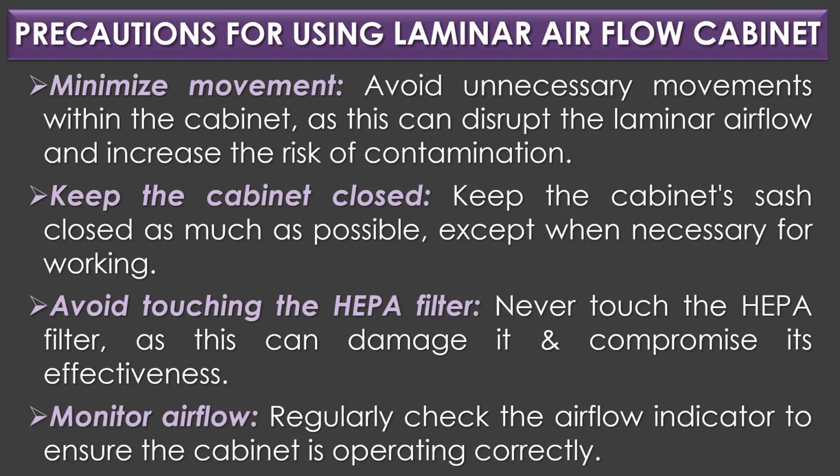Minimize movement. Avoid unnecessary movement within the cabinet, as this can disturb the laminar airflow and increase the risk of contamination. Keep the cabinet closed. Keep the cabinet sash closed as much as possible, except when necessary for working.